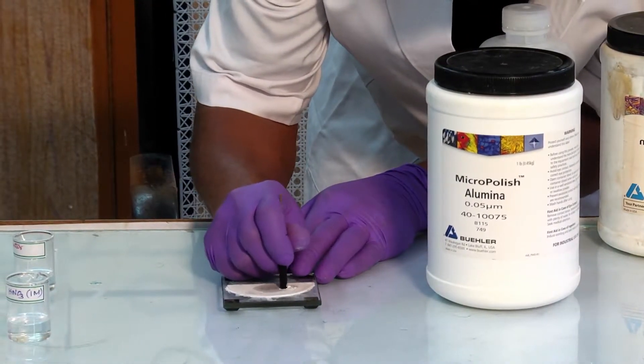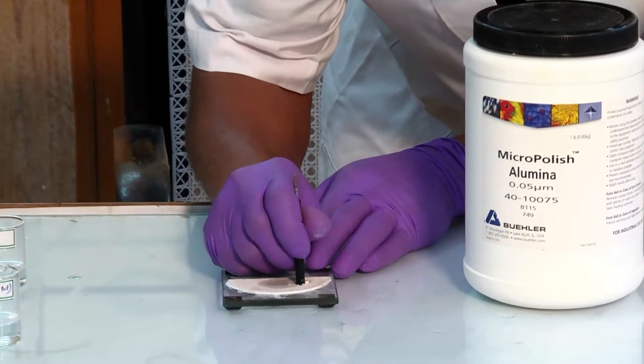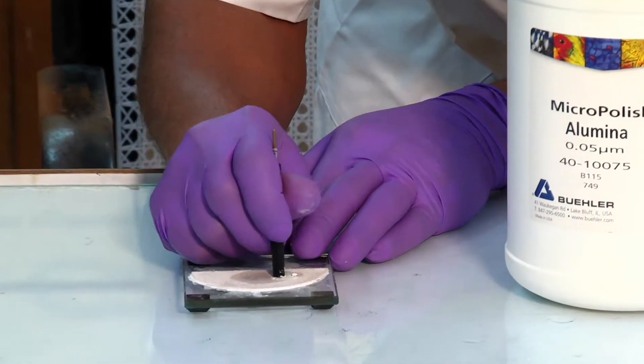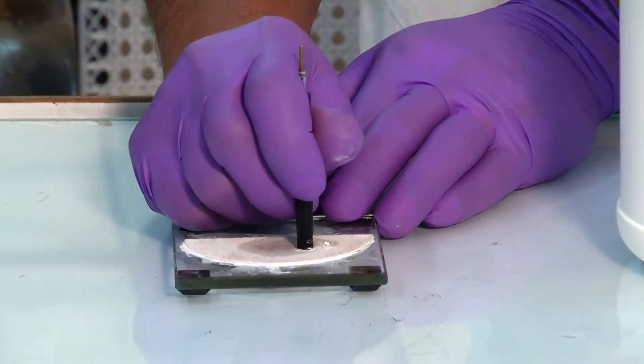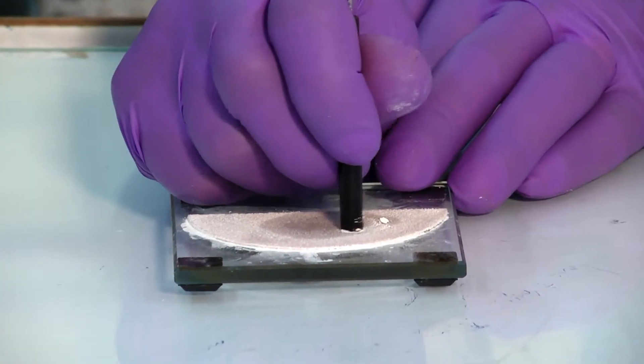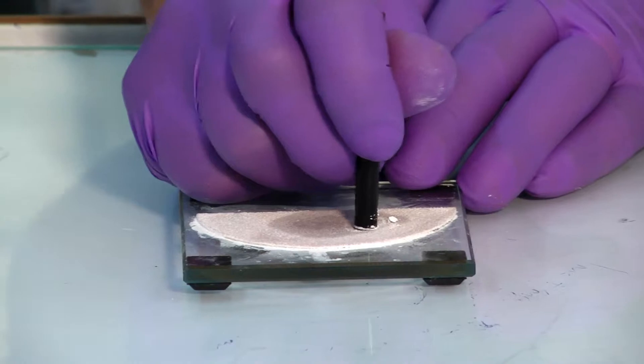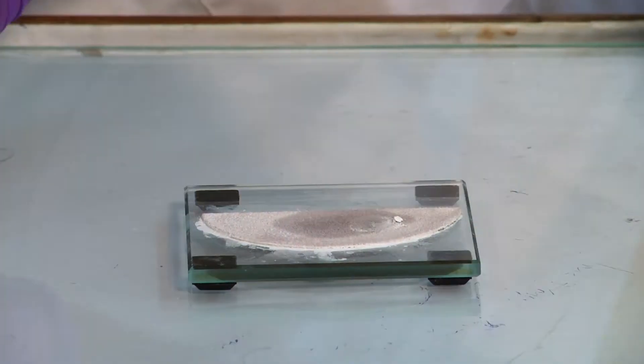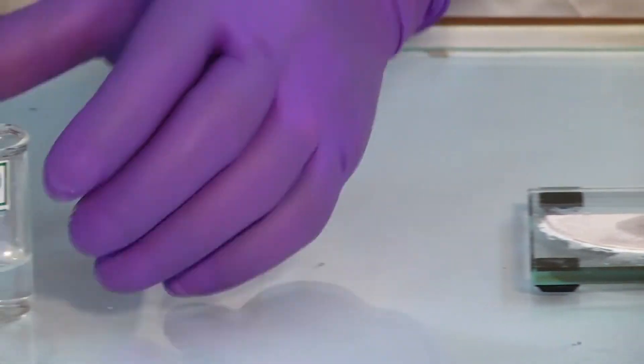This has been carried out by polishing the surface of the electrode on a microcloth using progressively decreasing size of alumina slurries like 1 micrometer, 0.3 micrometer, and 0.05 micrometer respectively.